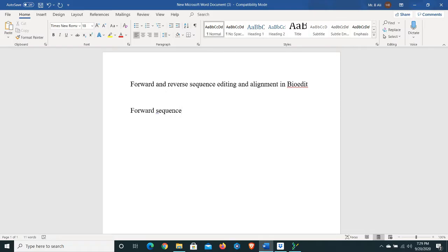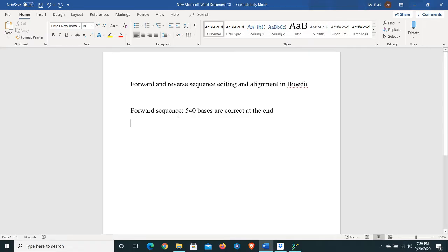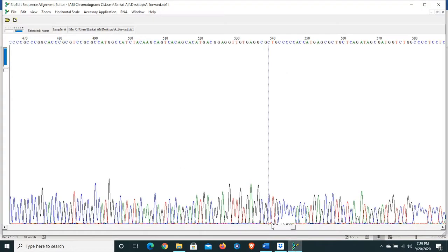Up to position 540, our forward sequence is good and correct at the end. Let's now look at the beginning of the sequence.